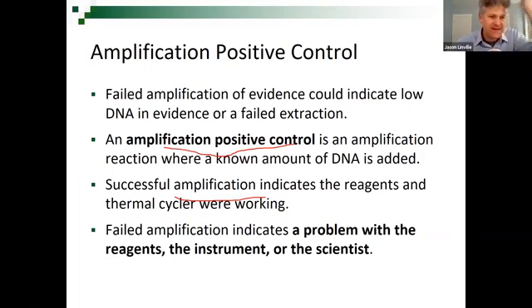Ariel asks if the DNA can expire. It has an expiration date on it, and when you're running an accredited laboratory, you want to abide by that expiration date. But with that being said, DNA is such a stable molecule. If you keep the positive control in your freezer, especially if it was bought from a company you know is very clean, with no nucleases in it, it will last for a very long time, like 50 years. So in general, even though it has an expiration date, you can use your positive control for a long time, especially if you're in a research lab.